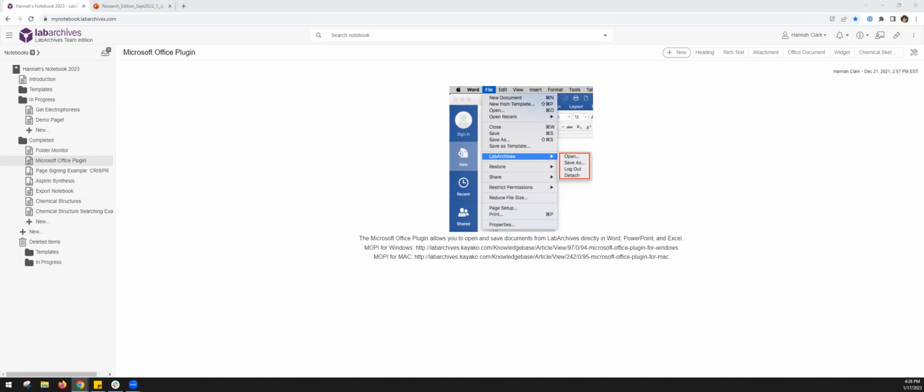So from what I'm seeing on my screen, the maximum individual file size for your license is 4 gigabytes per file. 4 gigabytes, okay. Yeah. Now that is a per file or per attachment limit. In some cases, there may be a storage limit for the total notebook. I always recommend less than 30,000 entries per notebook, approximately less than a terabyte. We always joke, we'll send you a free t-shirt if you ever get anywhere near that, because very few people ever do. Because realistically, you would have multiple notebooks.